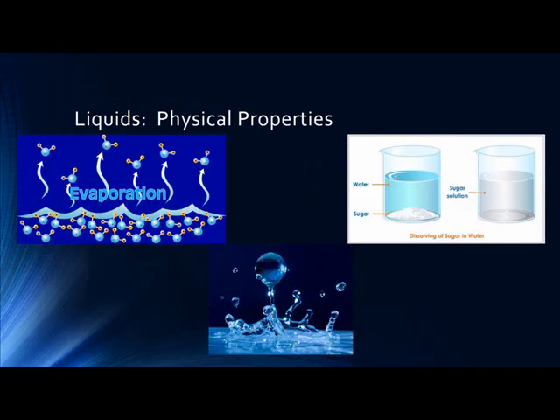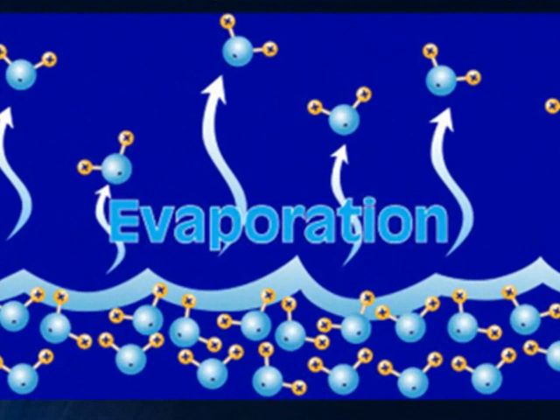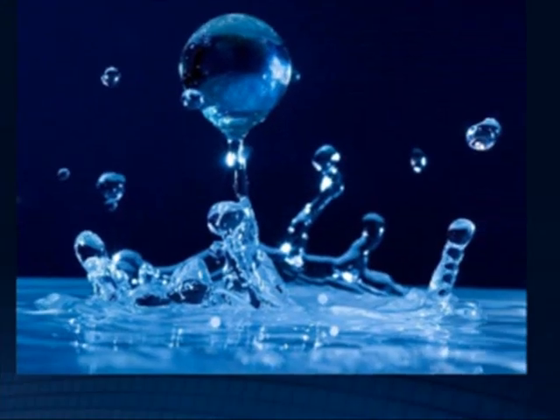The following physical properties will be observed and compared: an estimate of how long it will take 1 drop of liquid to evaporate completely. Evaporation is the process by which chemical particles or molecules escape into a vapor state from a liquid state. As the temperature of a liquid rises, more particles acquire sufficient energy to escape into a vapor state. You will observe the shape of a single drop of liquid.